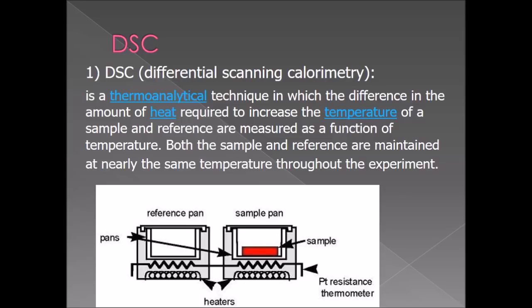Okay, so here's the definition of DSC. It is a thermal, heat analytical technique in which the difference in amount of heat required to increase the temperature of a sample and reference is measured as a function of temperature.